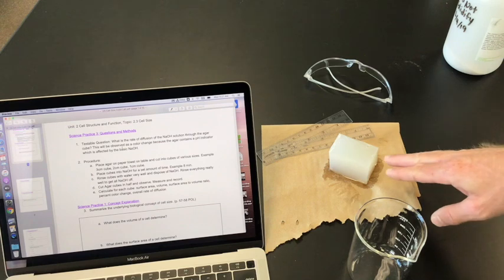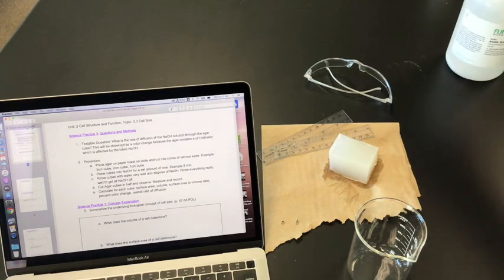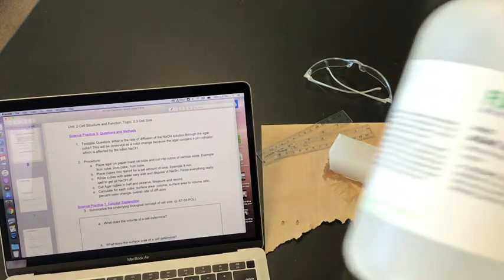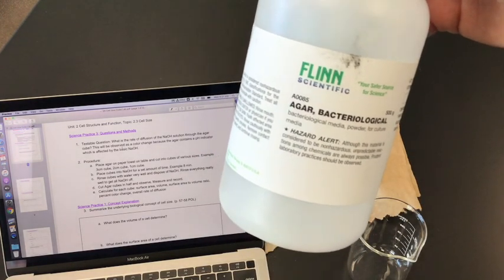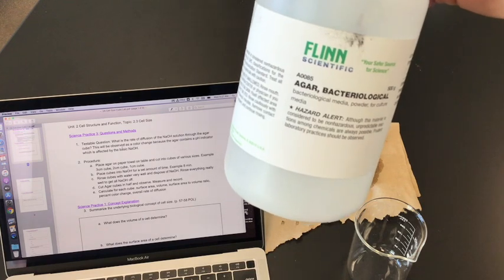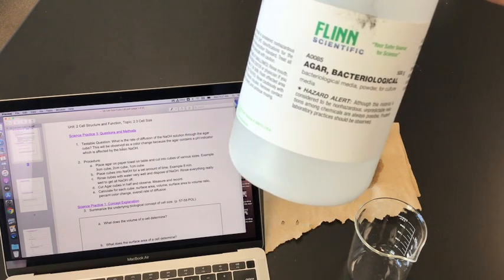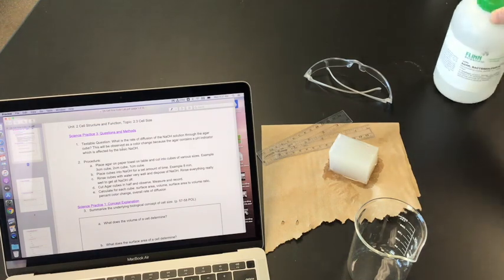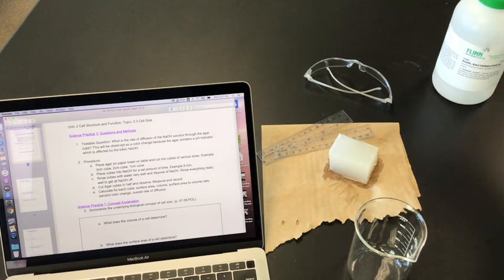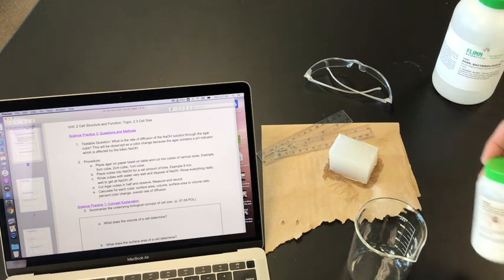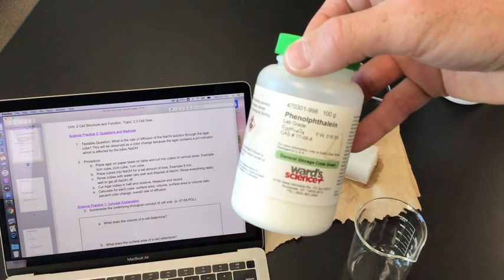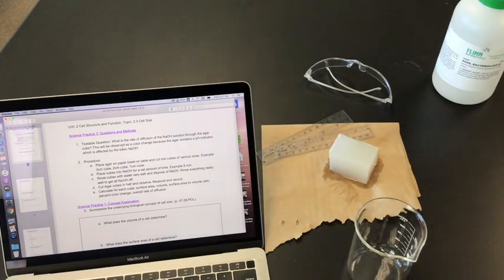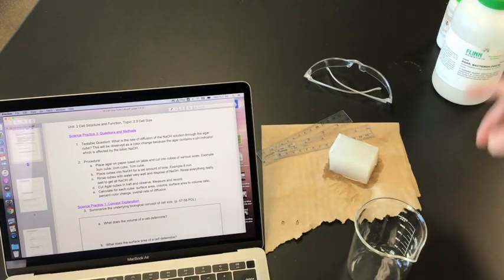All right, here's a block of agar that I prepared for you. I prepared it using this powder that you can just buy online. It's basically almost like a jello - you heat it, add it to water, heat it to boiling, stirring. And then I also added to the blocks we're using for this class a pH indicator, and the pH indicator we're using is called phenolphthalein. So I added a small amount of phenolphthalein because I wanted a color change to occur.